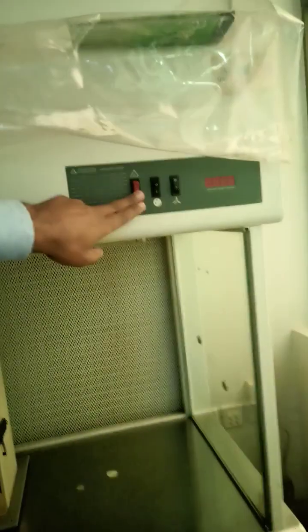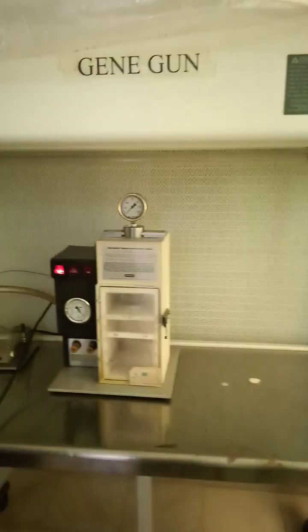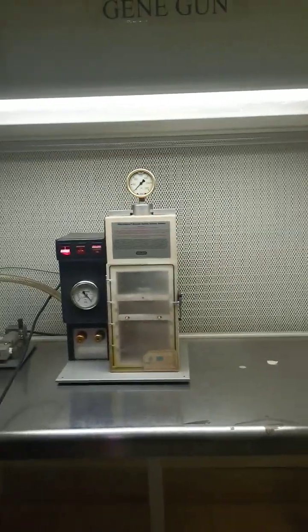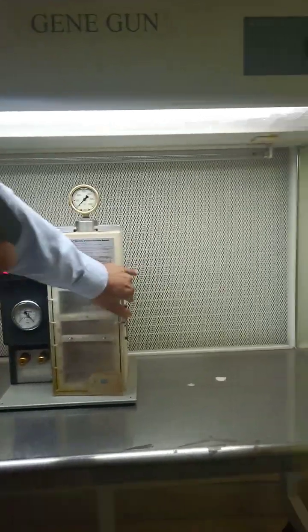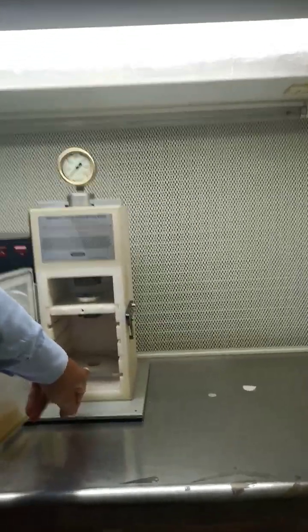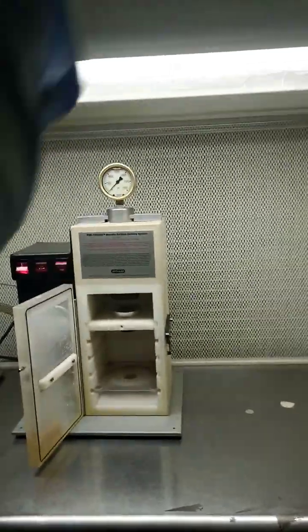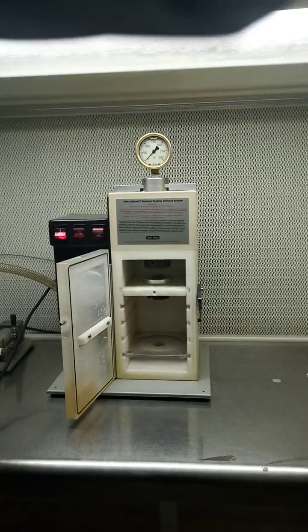This is the gene gun, because you can bombard your genes into the plant or animal source with the help of this gun. We coat DNA on gold particles and we put the tissue over here, whatever your target tissue is, animal or plant. Then with the help of the pressure generated through the cylinder, we push the button to fire, and your DNA penetrates into your target tissues.